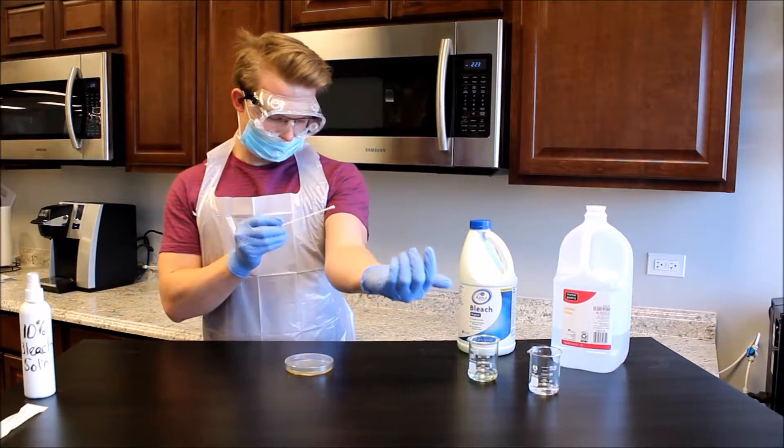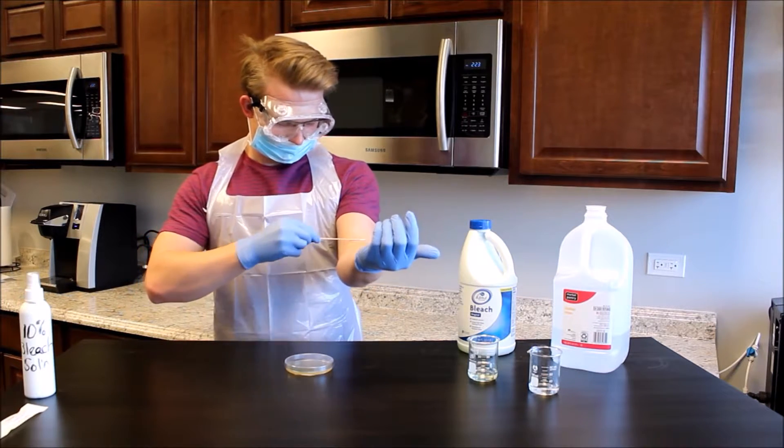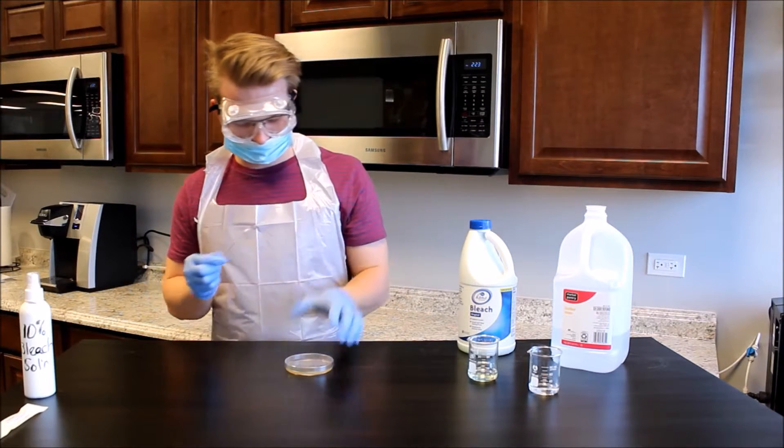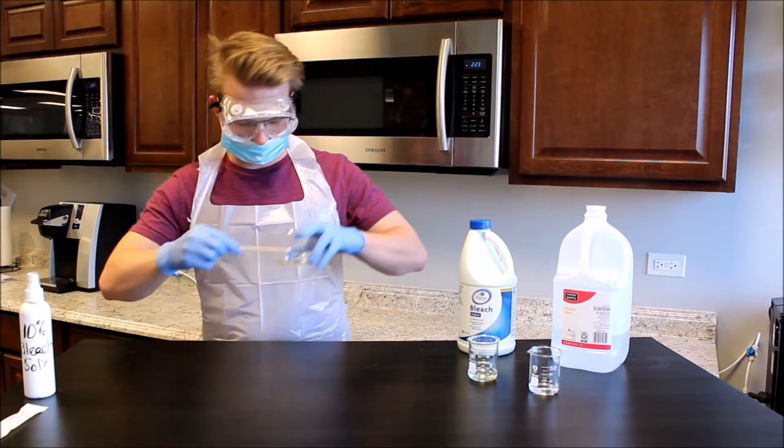Remove the swab and immediately swab the skin covering the inside of the elbow joint. While holding the swab containing the skin sample in the dominant hand, grasp the agar plate with the non-dominant hand and tilt the lid approximately one centimeter.